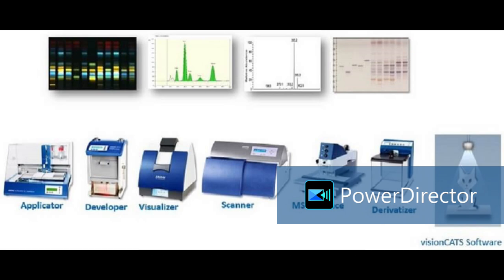So you can see this is the plate image under UV light, under white light and fluorescent light. So why is this plate greenish in color? Because in the silica gel material, while coating, they add one indicator which will give a fluorescent greenish color under 254 nanometer light. Okay. So under different wavelengths, what is the purpose, better visualization?